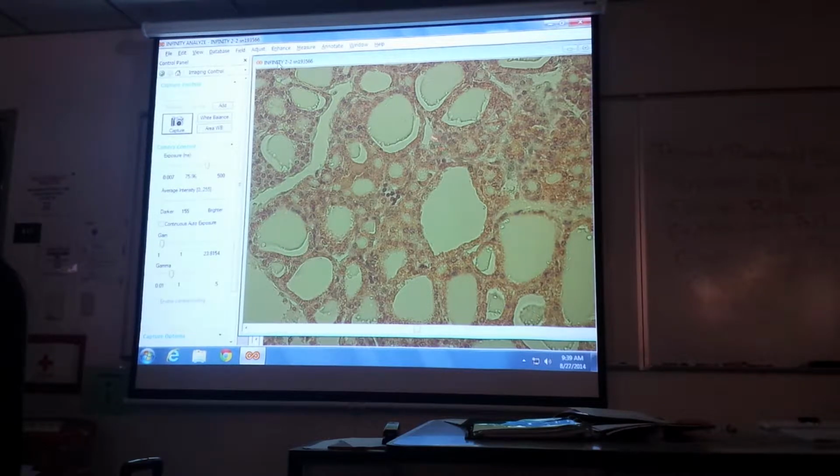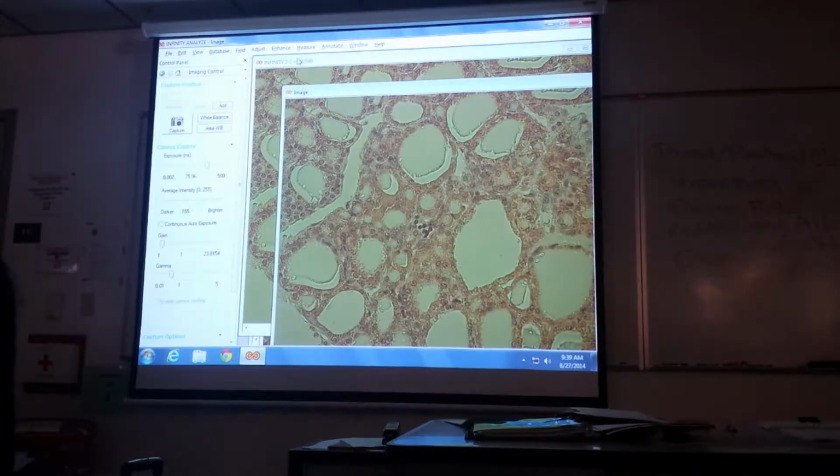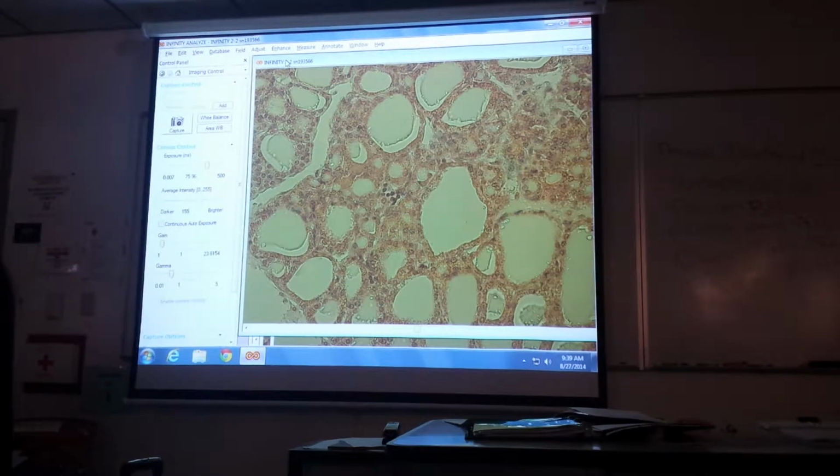Okay. These are good candidates. These are probably C cells. I'm not even sure myself. Okay, sometimes it's a judgment call for you and for me. But I'm going to take a picture of this too, and I think we can move on. If there's no further questions, give you a chance to make sure you understand before I move on.